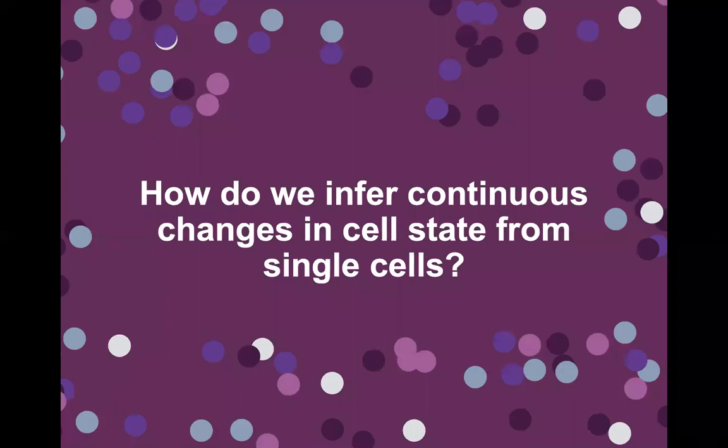So with that, I'm going to stop talking about clustering. I really would encourage anyone who has questions to stay after in the main session after the lecture. But I'm going to dive right into pseudotime and trajectory inference.